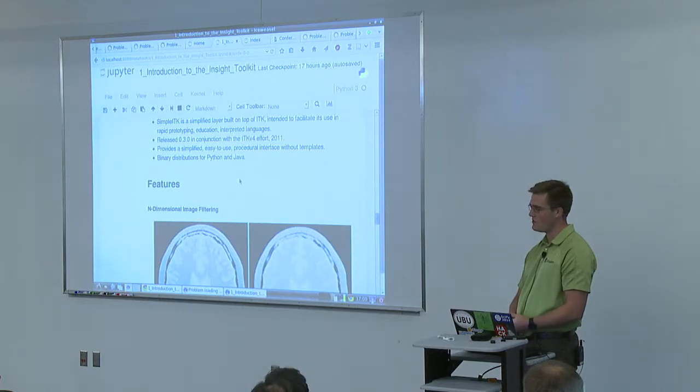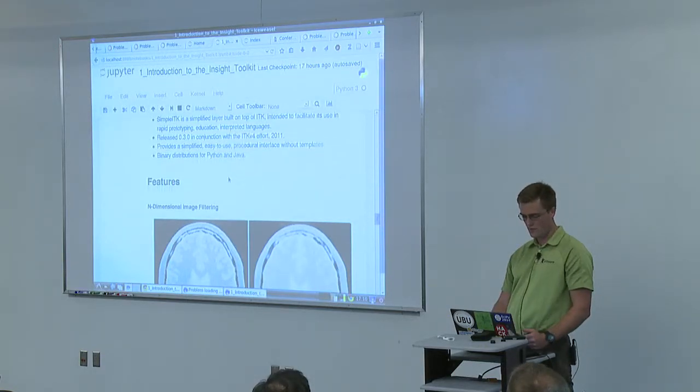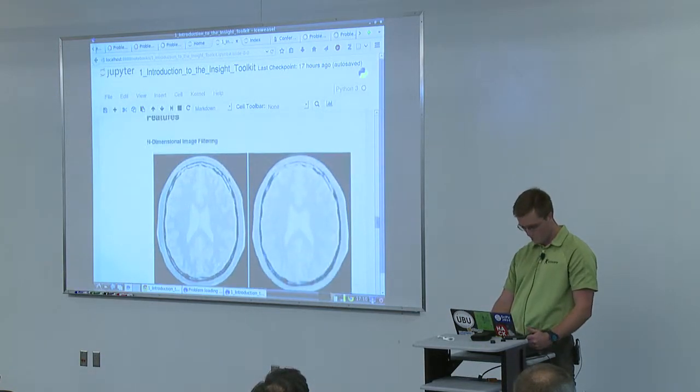And today we're going to be using the Python interface. And hopefully you find that even if you don't consider yourself a programmer, this is accessible and a useful tool available to you, and you're capable of using it.